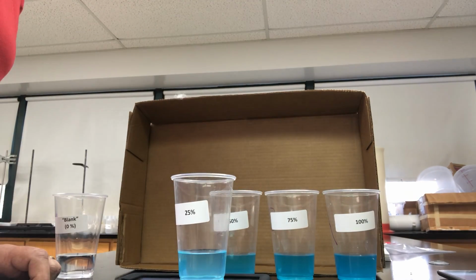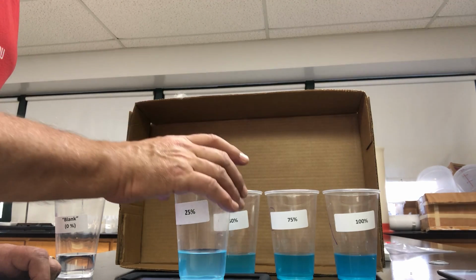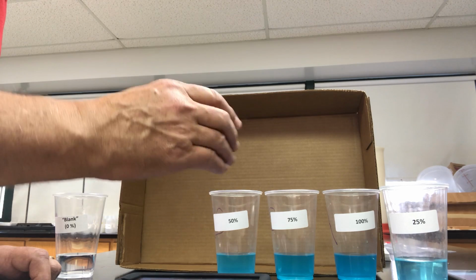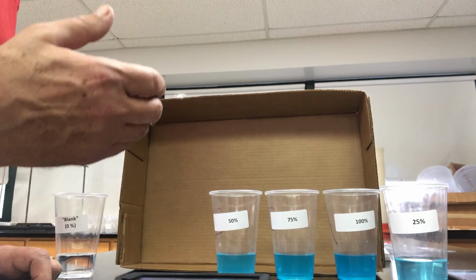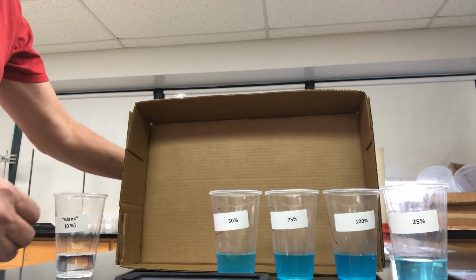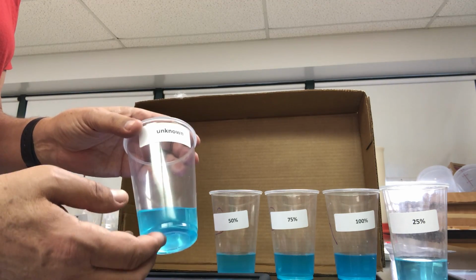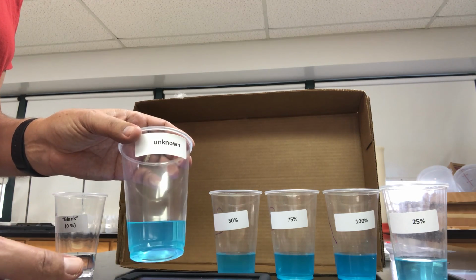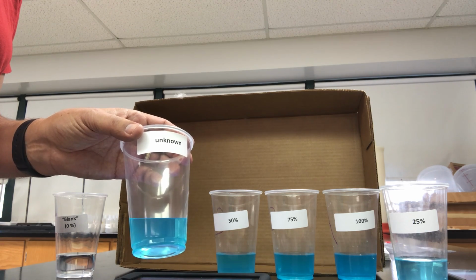So what you've got to do is just get the data table, graph the values for 25, 50, 75, and 100% concentration, make a graph, get the line of best fit, get the equation for the line of best fit, and then there's also a value for the transmittance, or rather the absorbance of red light by this unknown concentration. Your job is to tell me what that unknown concentration is.